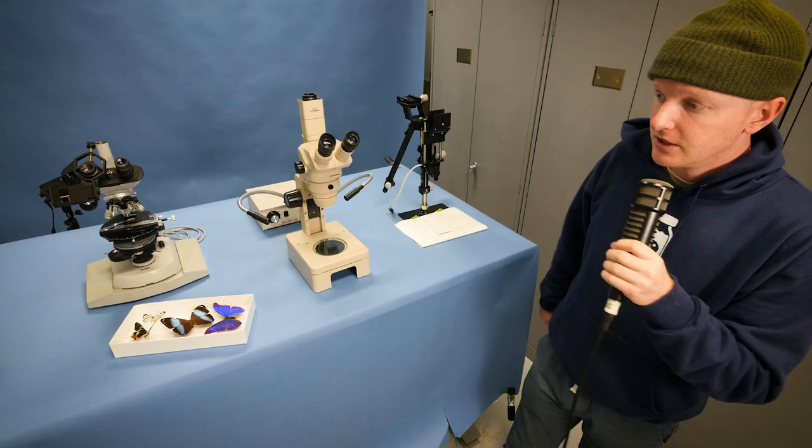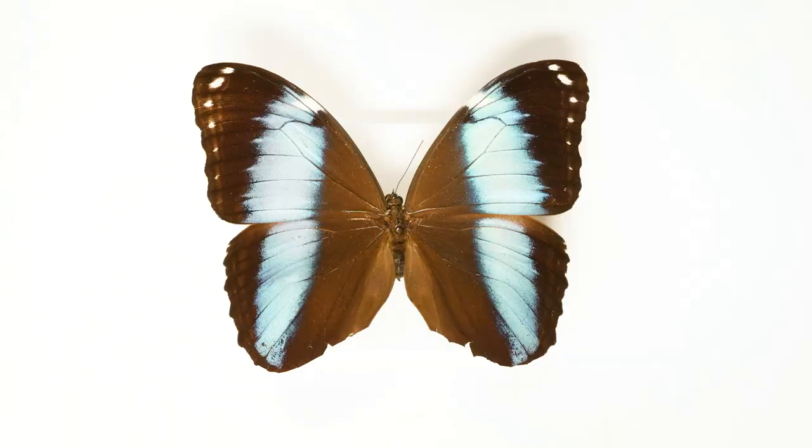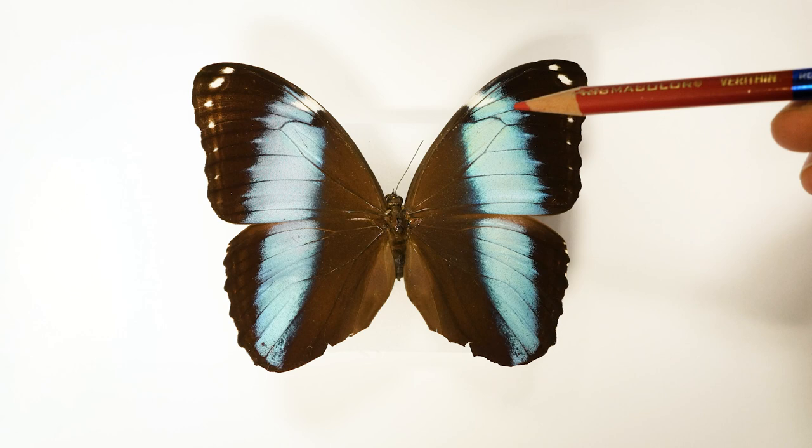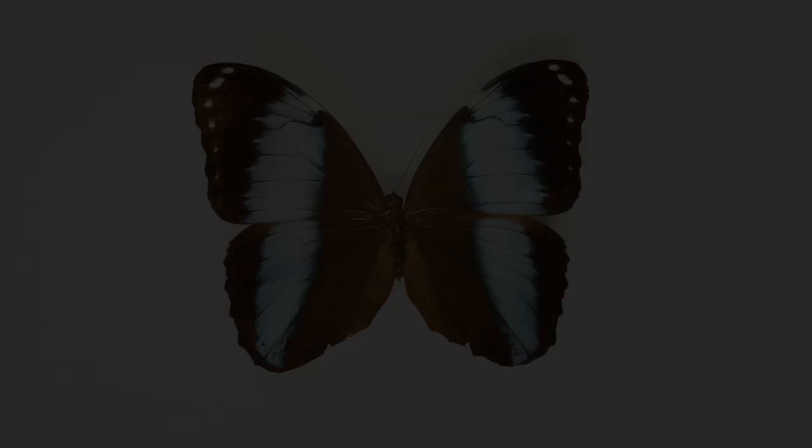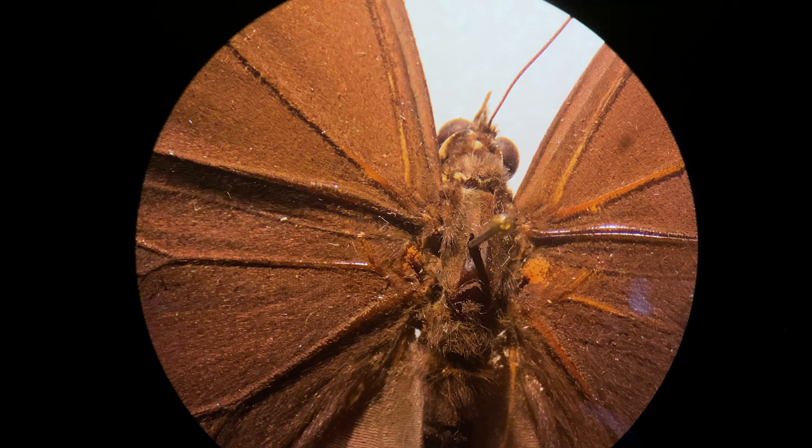We're going to start with the morpho. Okay here's our blue morpho. I kind of want to check out these blue stripes under the microscope. I think they'd be the most interesting. So let's check them out. So this is the center of the butterfly. Let's move it over to the left. And you can see that blue stripe kind of coming in to view.